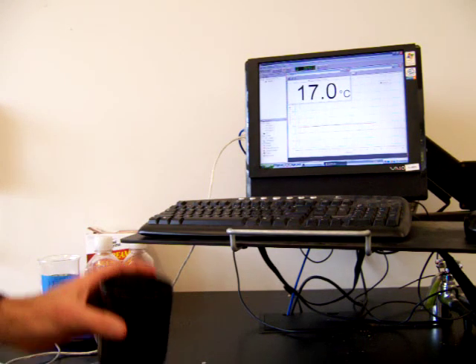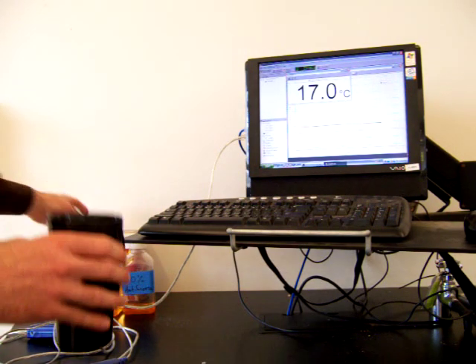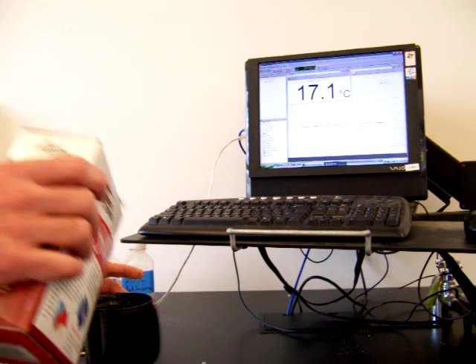Our setup here, we have an ice bath, so this is ice in an insulated container. And then I've added some salt to it.